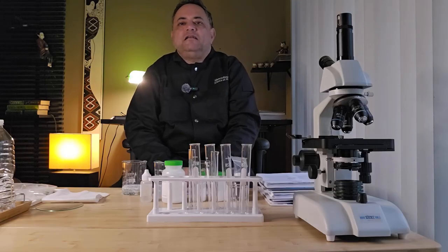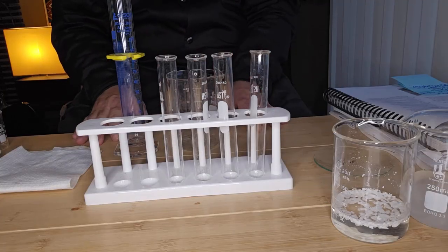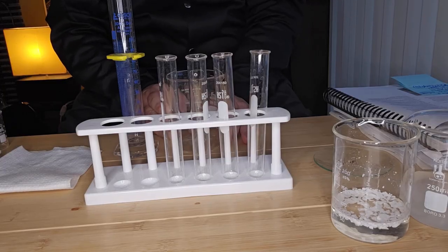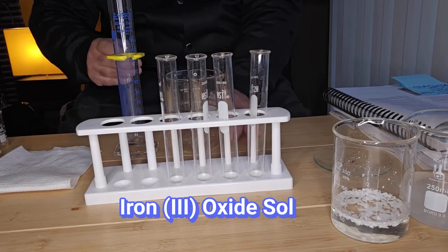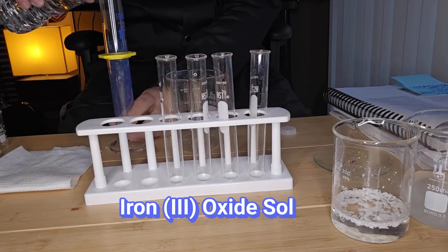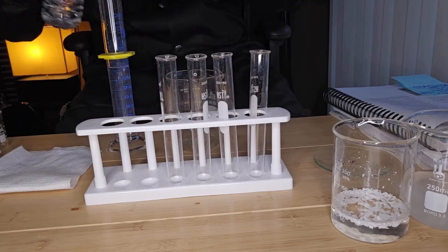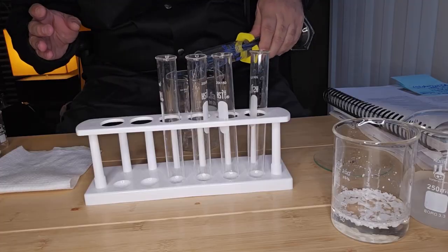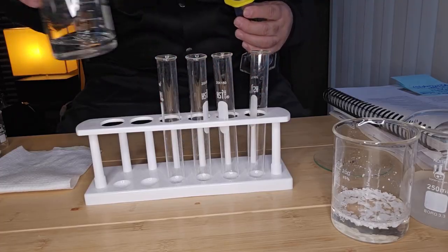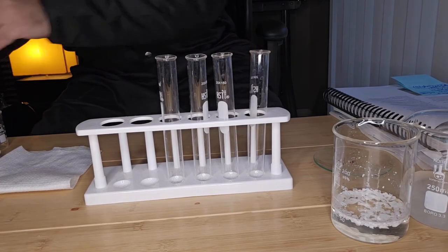Okay, for the first part, let's now make our sol. First things first, we're going to prepare our iron 3 oxide sol. I need to heat 75 mLs of water to boiling. I'm just going to put that on my hot plate, and that will boil nice and quickly, I hope.